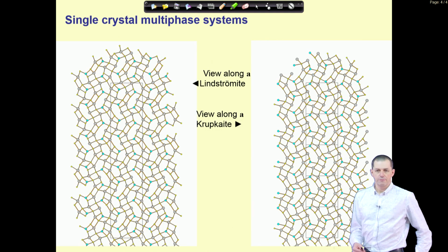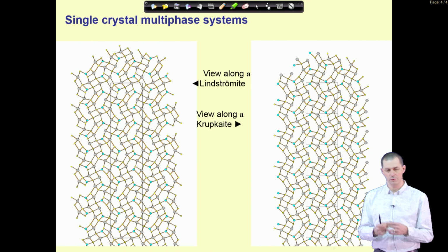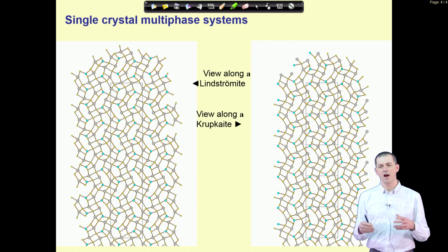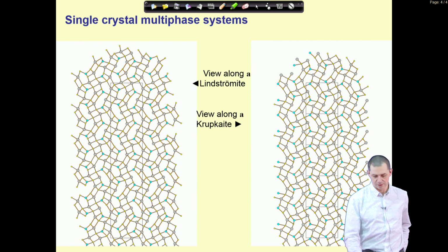It's common to have polyphasic samples in powder diffraction. Of course, in Jana you can work with powder diffraction with multiple phases in the powder diffraction pattern, refine them simultaneously, but you can have also multi-phase single crystals. If you have an oriented intergrowth of several phases in a single crystal, you obtain a single crystal pattern, but that contains more phases. That is also possible to treat in Jana. It's actually treated as an allotwin, so twin of two different phases. They can be both described and refined simultaneously.